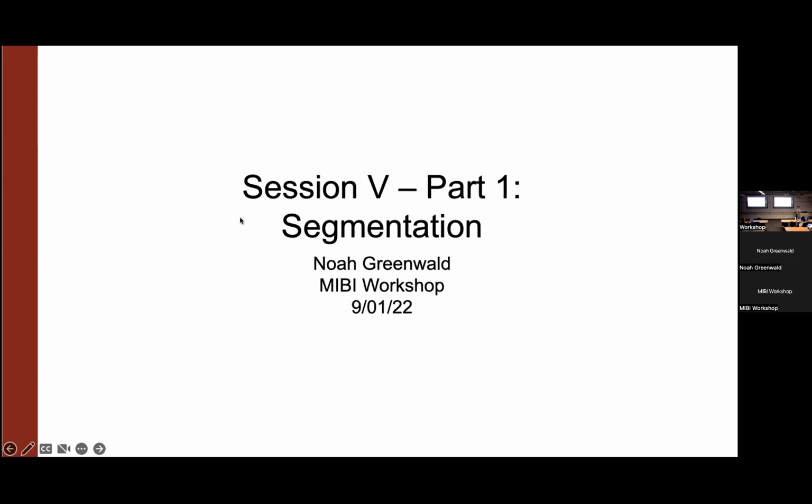Okay, and with that, we'll turn it over to Noah for our first talk of the day. Great, thanks for having me. I'll be telling you about the work that we've been doing for putting together our segmentation pipeline.